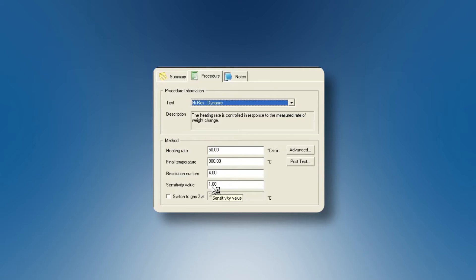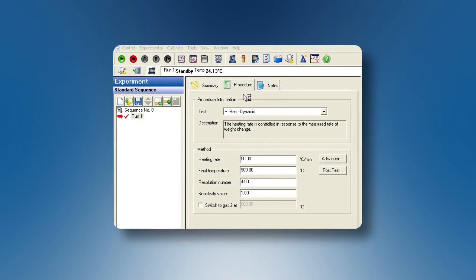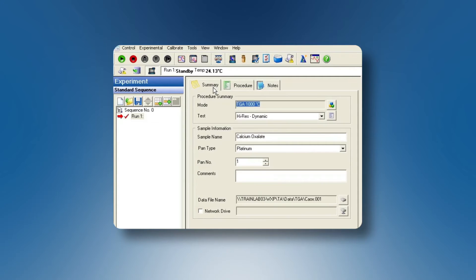With this configuration we will make high-resolution TGA experiments pretty easy. Once the experiment is configured, we only have to go to the summary to introduce our sample name, our pan type, and also the data file name — and that's it, we are ready to start.